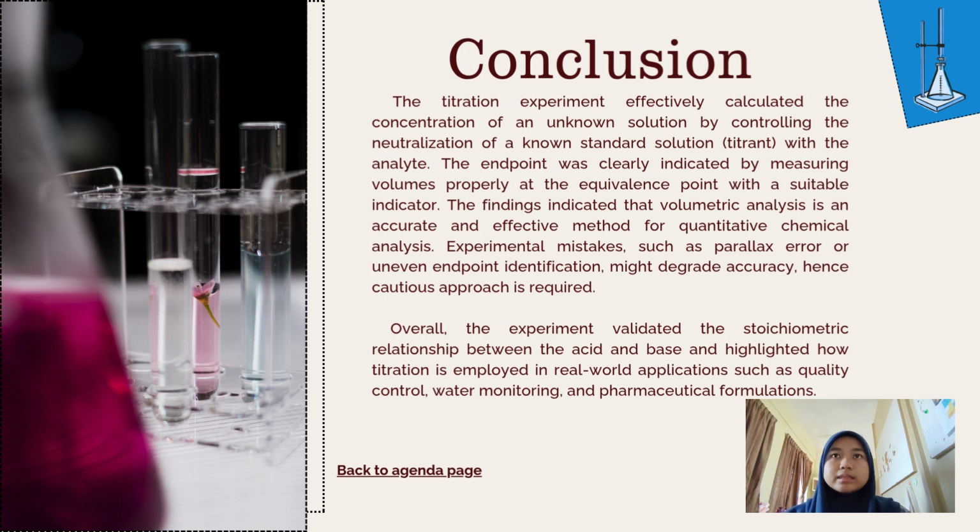The findings indicated that volumetric analysis is an accurate and effective method for quantitative chemical analysis. Experimental mistakes such as parallax error or uneven endpoint identification might degrade accuracy, hence a cautious approach is required.